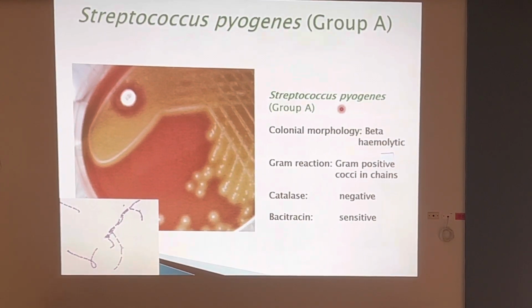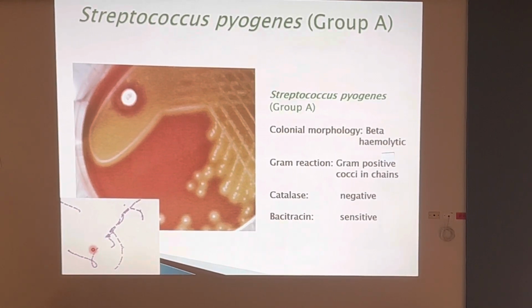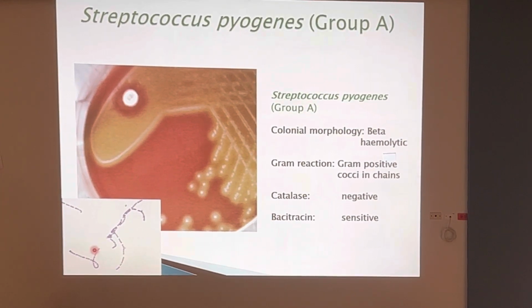We do a gram stain, and this is what the gram stain showed. We're looking at gram-positive cocci in chains. This sounds like strep. First of all, remember I told you, staph present in clusters. Streptococci tend to present in chains or in pairs, all right? So here we have chains. Plus they're beta hemolytic. This pattern of beta hemolysis looks strepish, but don't worry about that.